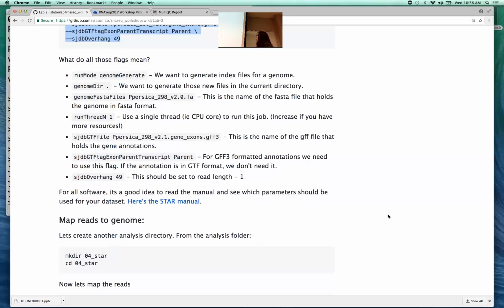And there are going to be more places in the genome where there are exact words, so you need to go check all of those places to see if your read maps. So it's a trade-off, right? If you want fast and exact, big word sizes. If you want slow but able to handle more noise, smaller word sizes.